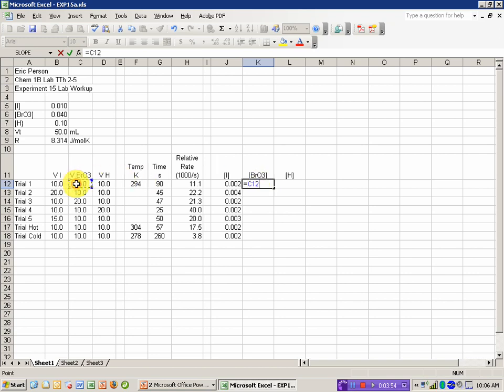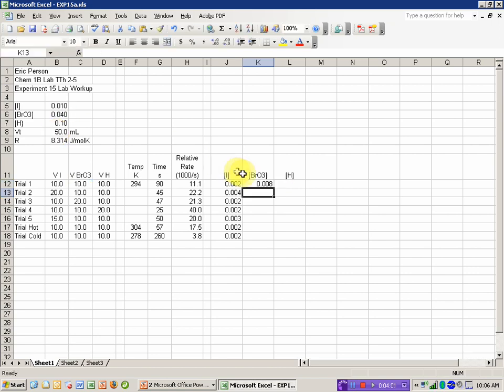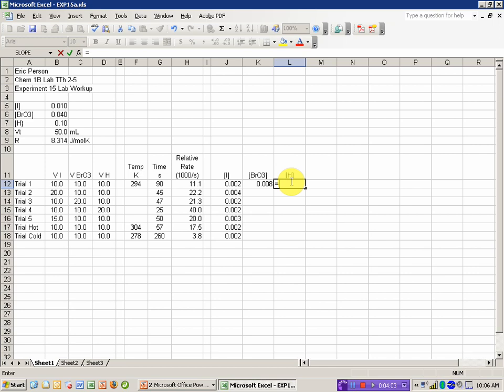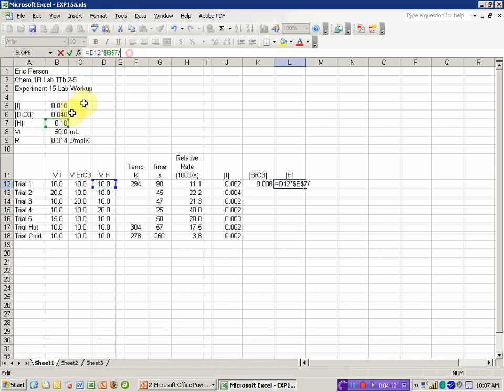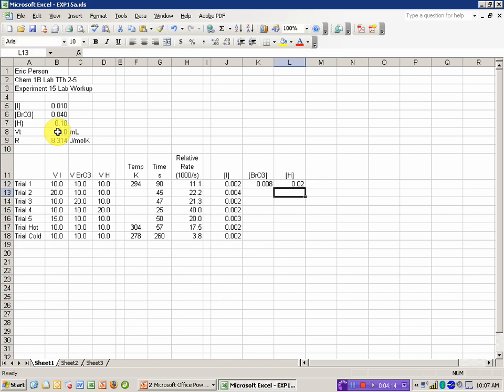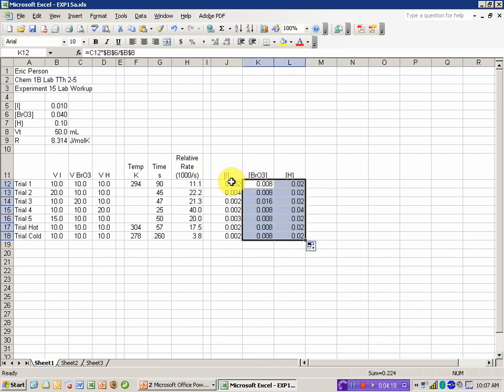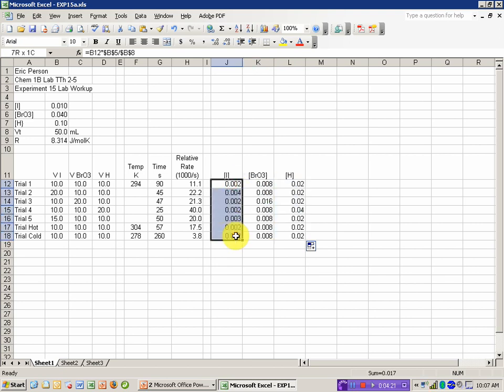Bromate's going to be done similarly. It's the volume of bromate times the stock concentration divided by the total volume. And the hydrogen ion is likewise the volume of hydrogen ion times the stock concentration, I should make that an absolute reference, divided by the total volume.